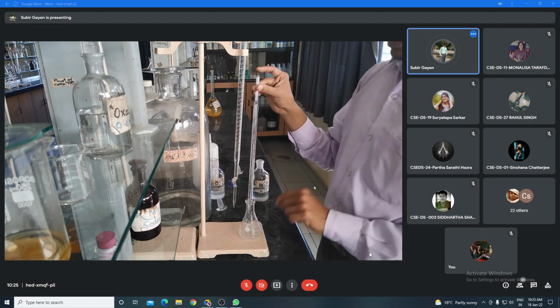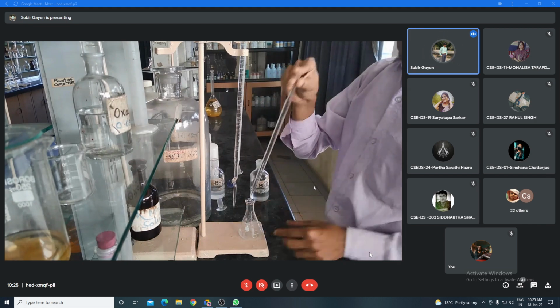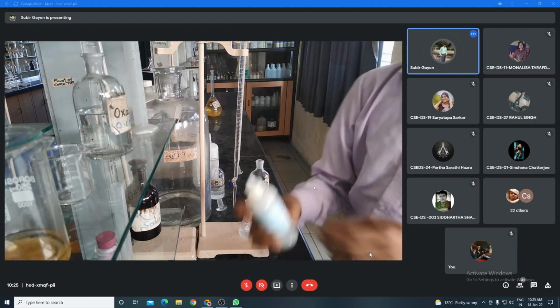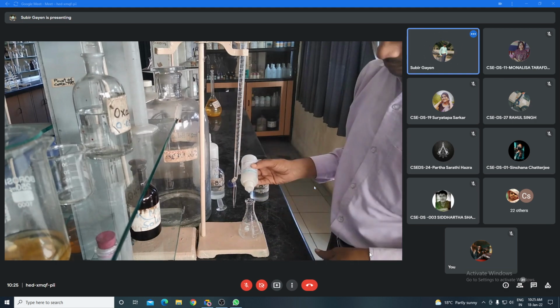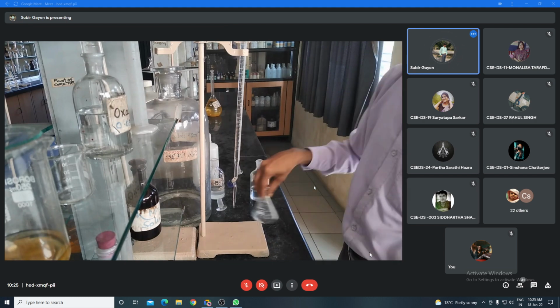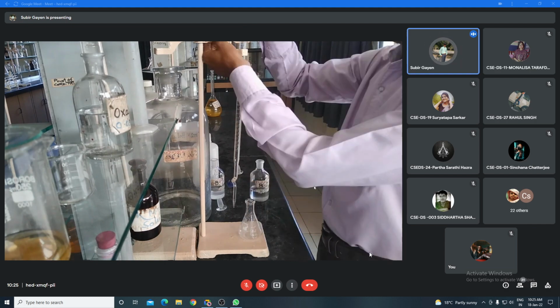It is 2 ml upper layer of bottle 2. Again into this solution I will add indicator, 1 drop. Now I will titrate this solution again with sodium hydroxide solution.